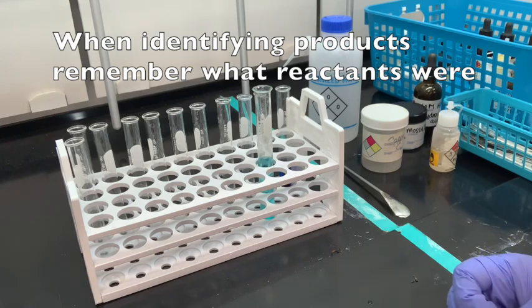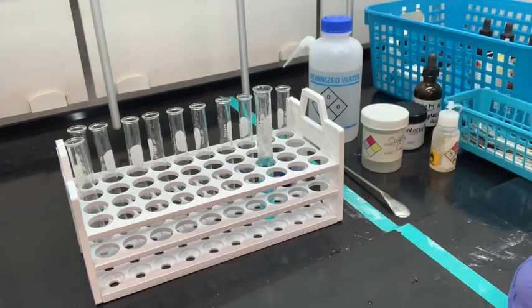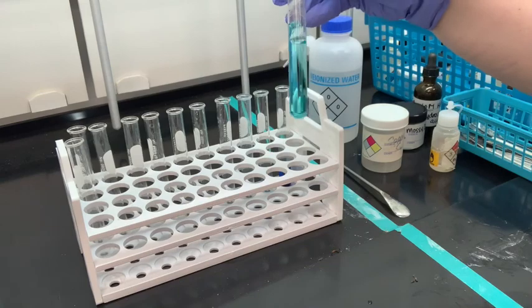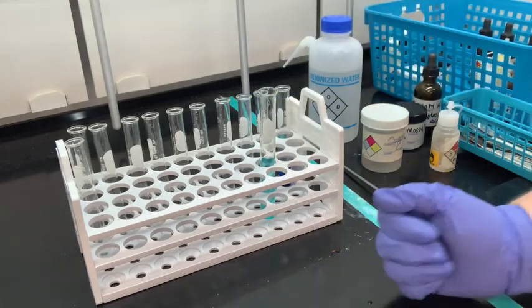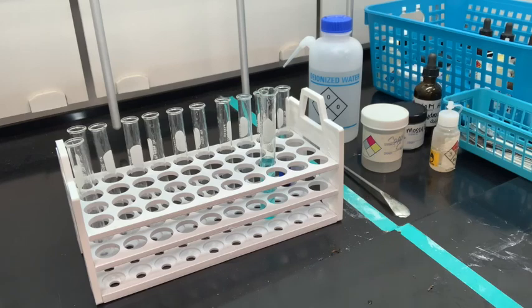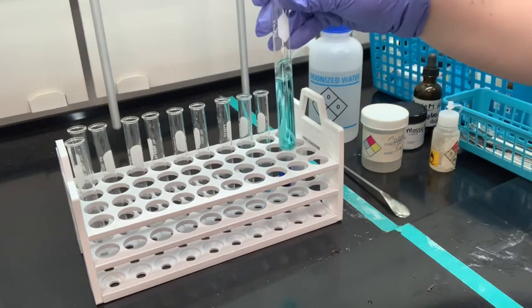Okay, so we couldn't have made copper 2 sulfate. Copper 2 sulfate is also a blue solution. It might look kind of similar to this, but we started with copper and nitric acid. There's no way we could magically form copper 2 sulfate. There's no sulfate in here to begin with, okay? So you want to keep that in mind when you're trying to identify your products.